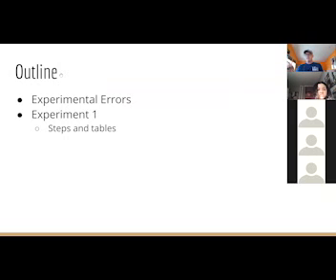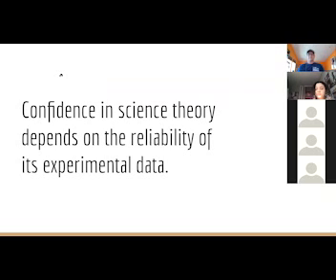So just the outline of the experiment. We're going to be looking at calculating experimental errors. And then in this first experiment, we're going to be going over the steps of doing it, setting up the tables, and then how to report your data.